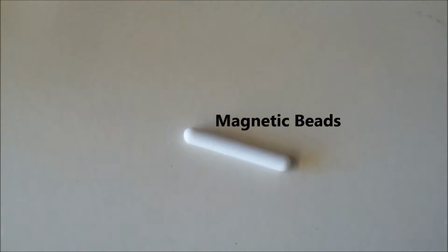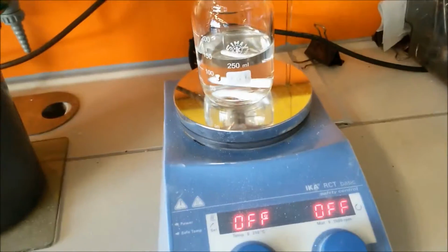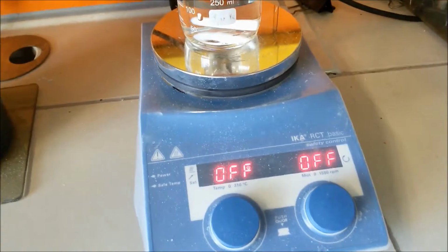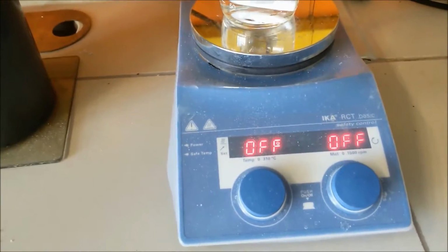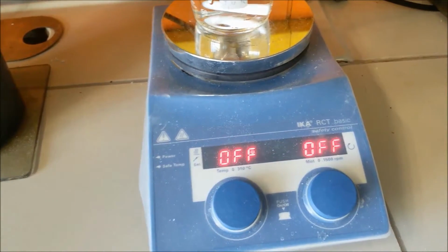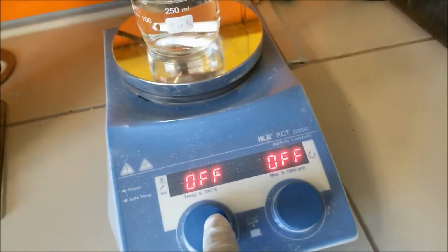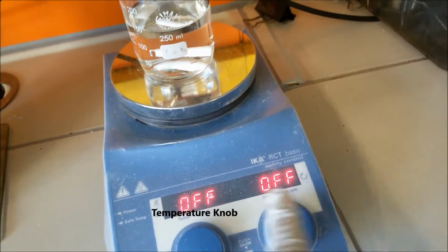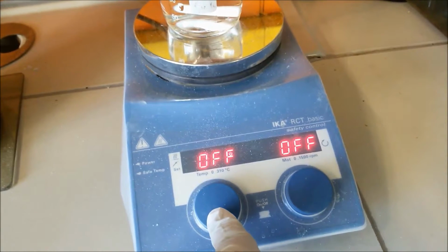We put them, we do it gently, we add a magnet, which you can see. I already added one inside, and the magnet looks something like this, very small in terms of size. We put this bottle on top of this magnetic stirrer, and then we will mix. This is one type of magnetic stirrer. In this one, you can see the two features. One is telling you the temperature, and another is telling the RPM.